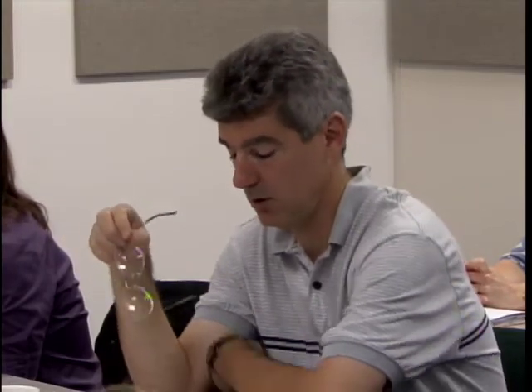Oh, yeah. So it's scanning one channel at a time, but it detects all of the wavelengths at the same time. So there's no disparity in the wavelength. There is effectively a time difference in the scan, but ever so small between lane 1 and lane 2 and lane 3 because it's moving across. All the detectors detect all the colors simultaneously. That's correct, for each channel. Okay, I got it. That's correct.